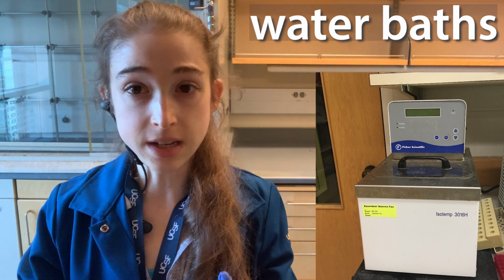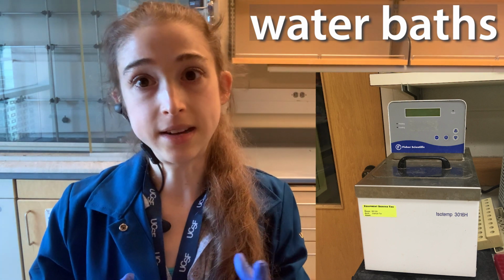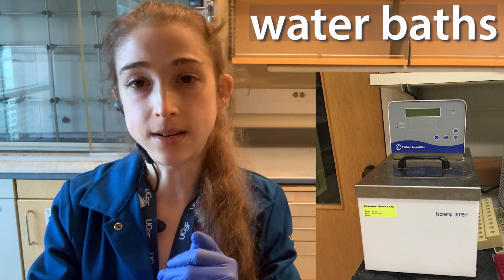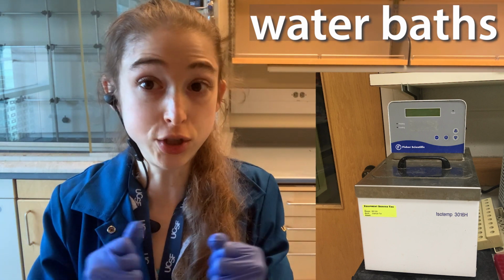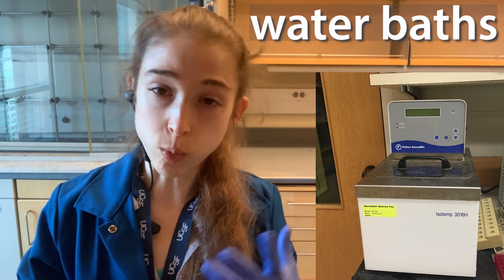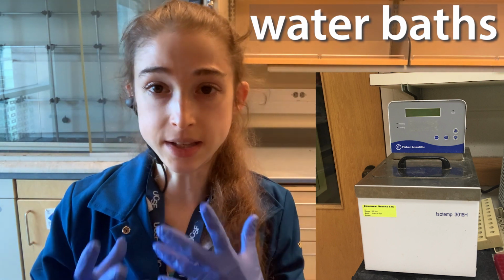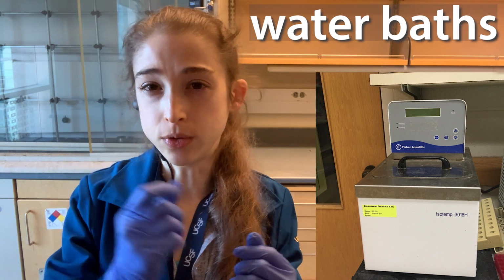You might also see bead baths, which are alternatives to water baths, and instead of water they have these metal beads. You see these a lot in cell culture rooms, like tissue culture rooms, your TC room. They're easier to keep sterile than water, and so you might often see those in tissue culture rooms to thaw cell stocks, or to warm up the media, the cells' food, and that sort of thing.